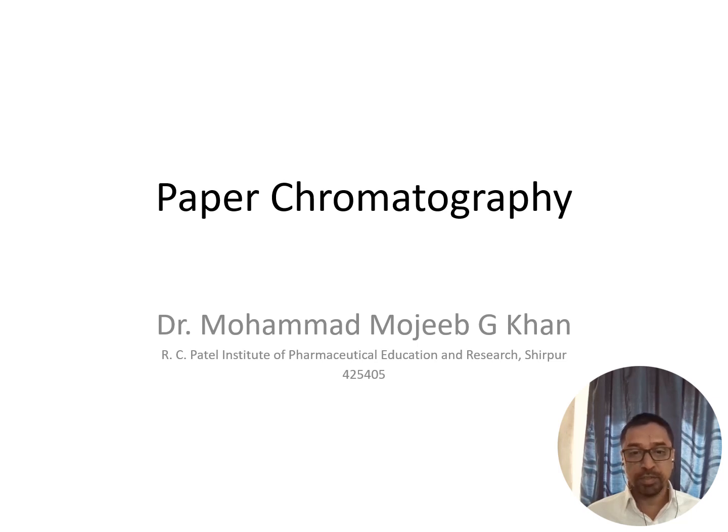Here I am presenting paper chromatography. What is paper chromatography? What is the principle of it? Then how can we implement this technique for practical purposes, that we can learn over here.